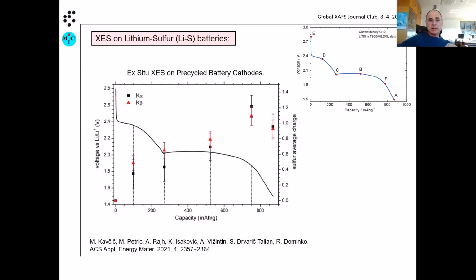The problem is that to measure a static sample is not a problem, but when you hit the battery, you start to modify the electrolyte, and the electrochemistry is gone. We have tried several things, and it's not easy, but it can be done. For more details, you should check the paper. Okay, so these were, I would say, promising results.